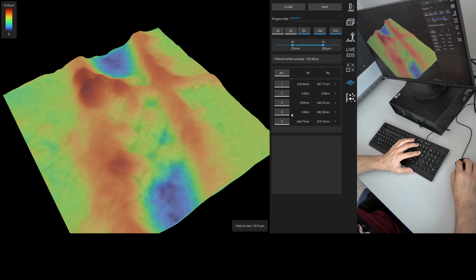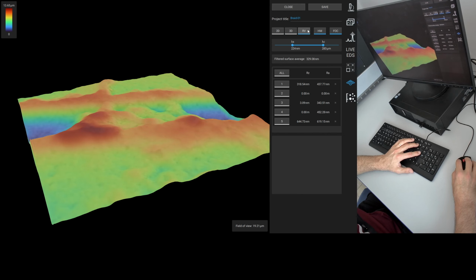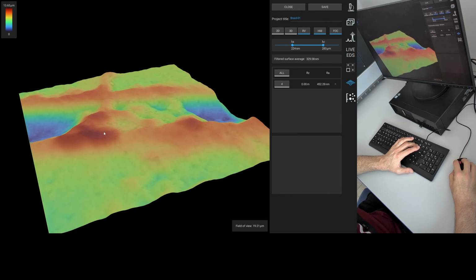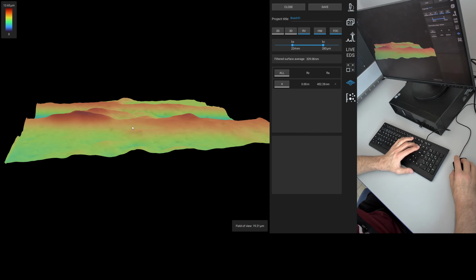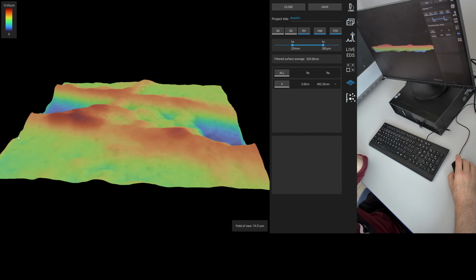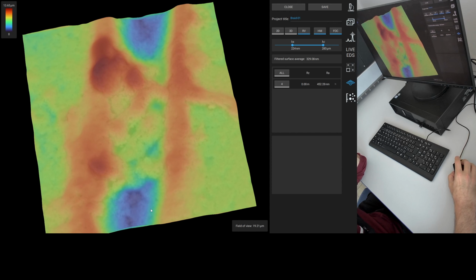Whoa, okay. I've got to try and remember how to delete these things. That is the 3D view. What's that? Okay, that is, I think, adjusted for. Okay, so that is the relief view. So it's normalizing it and showing you the actual channel depth. So we're going to find out all kinds of information. It's consistent between here and here. So we're going to find out how deep that channel is. And see, note it's deep and then not so deep. So, you know, that's reflective of the 3D nature of this orbiting structure.